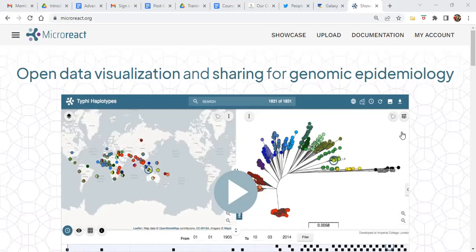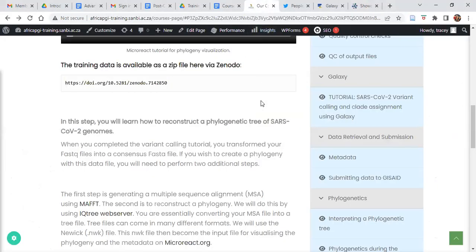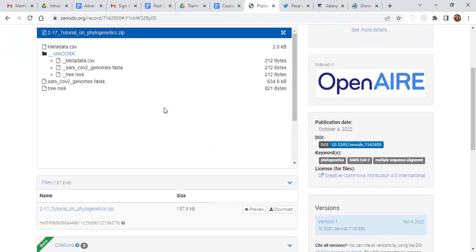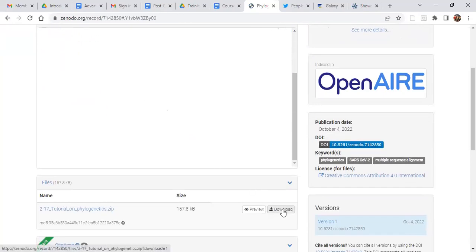Whether you've used the SARS-CoV-2 workbench at SANBI or Galaxy, you would have produced multiple consensus files which are representative of the blueprint of your genome or sample — all the bases for all the different positions throughout the SARS-CoV-2 genome. We will provide you with the samples. If you look at the course material for the Microreact tutorial, you will see a link to Zenodo at the bottom of this video. Click on that link and it will take you to the phylogenetic training files. Click the download button and it will download a zip file for you.